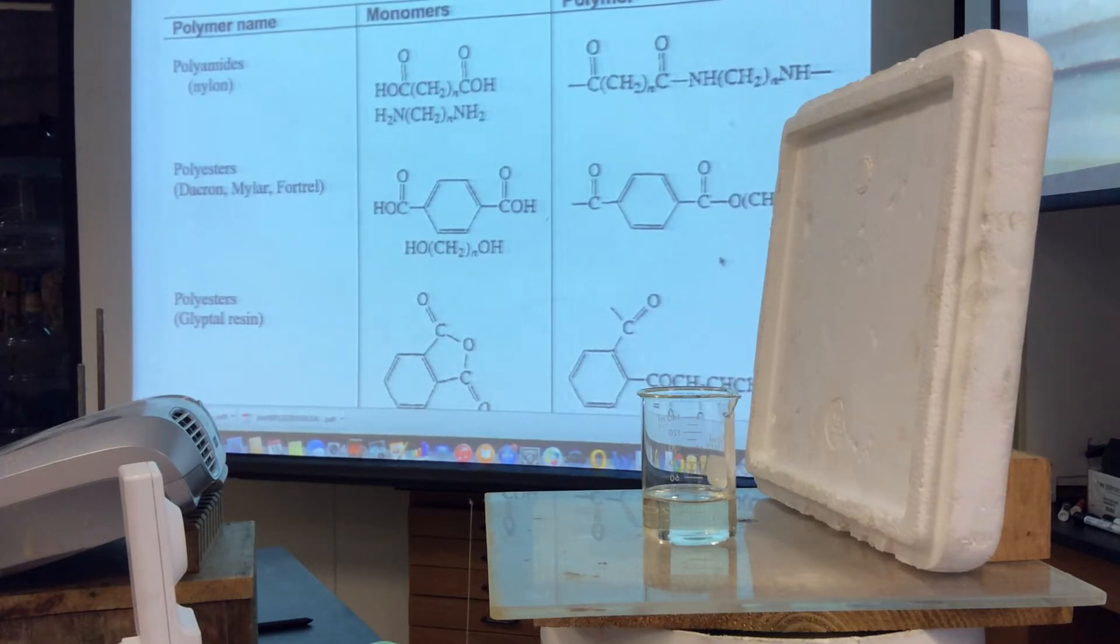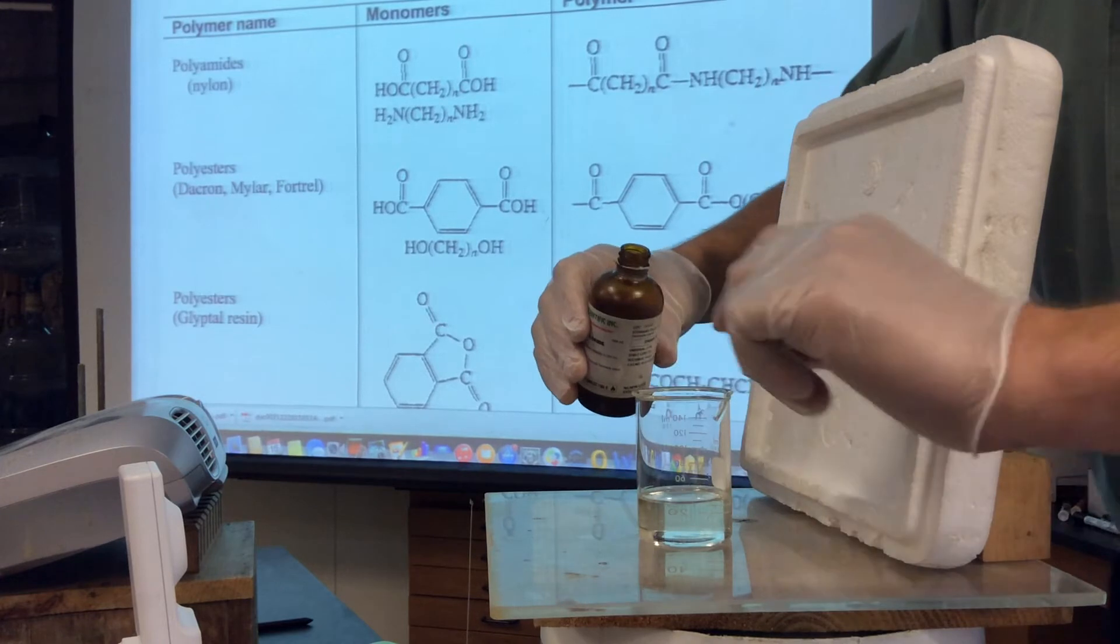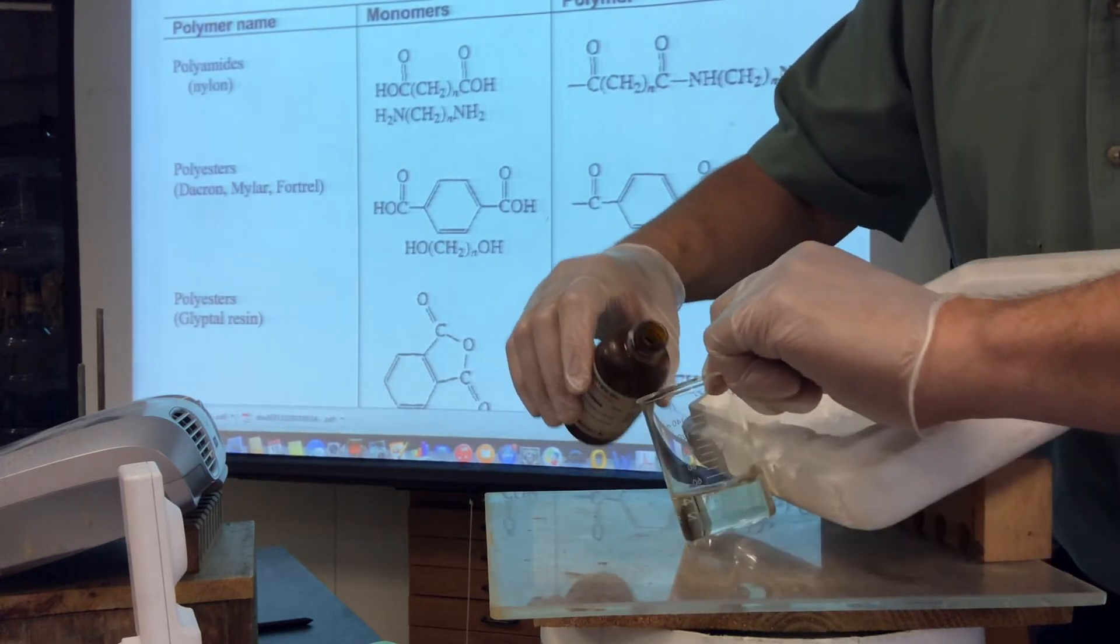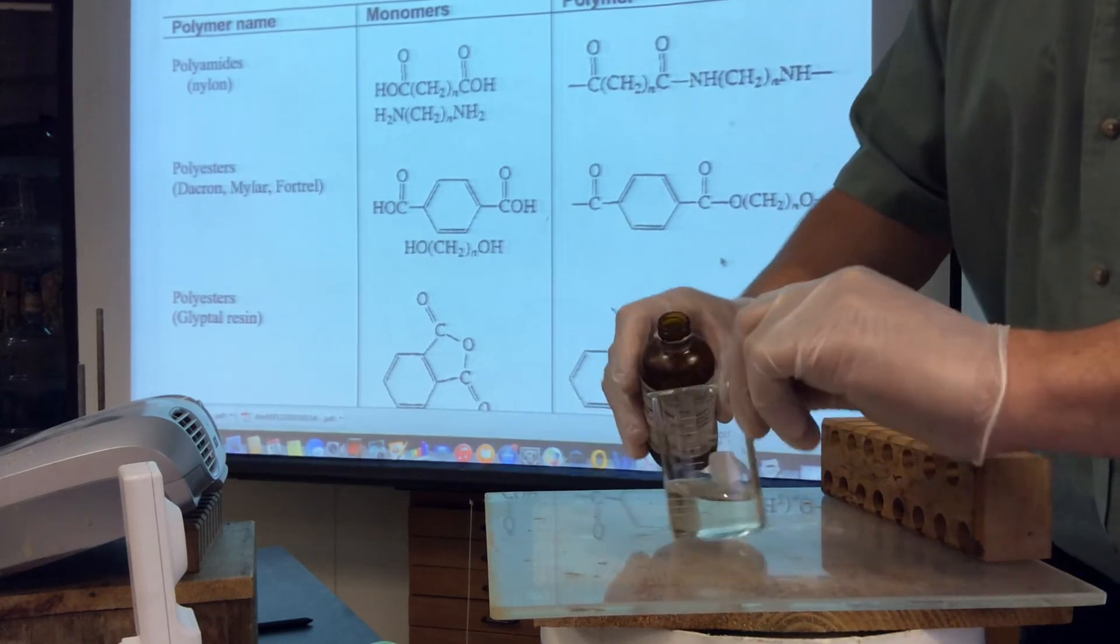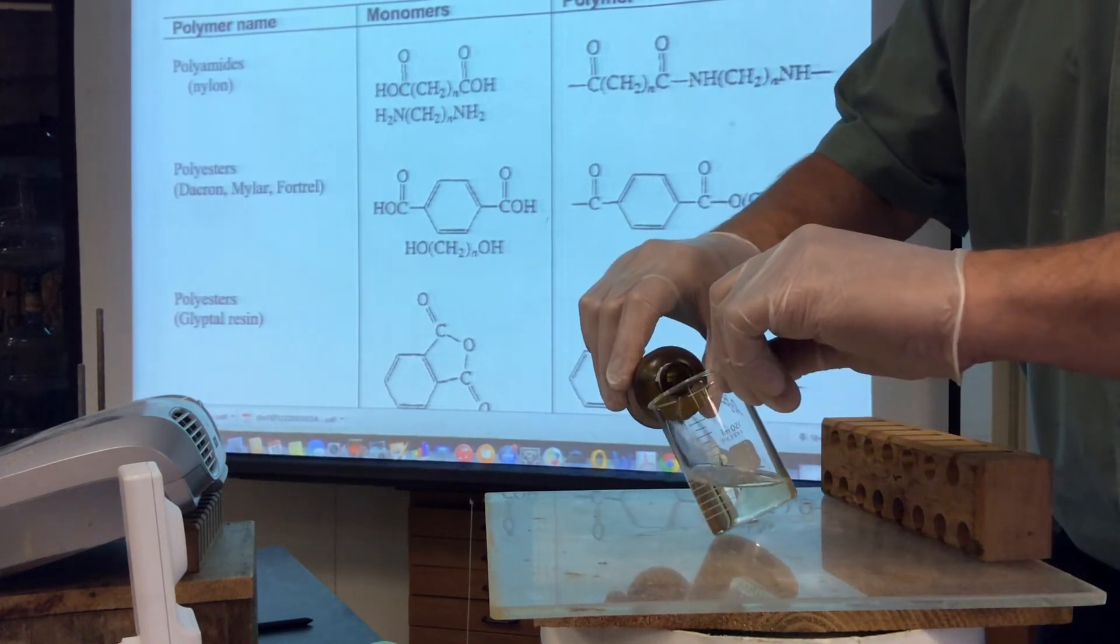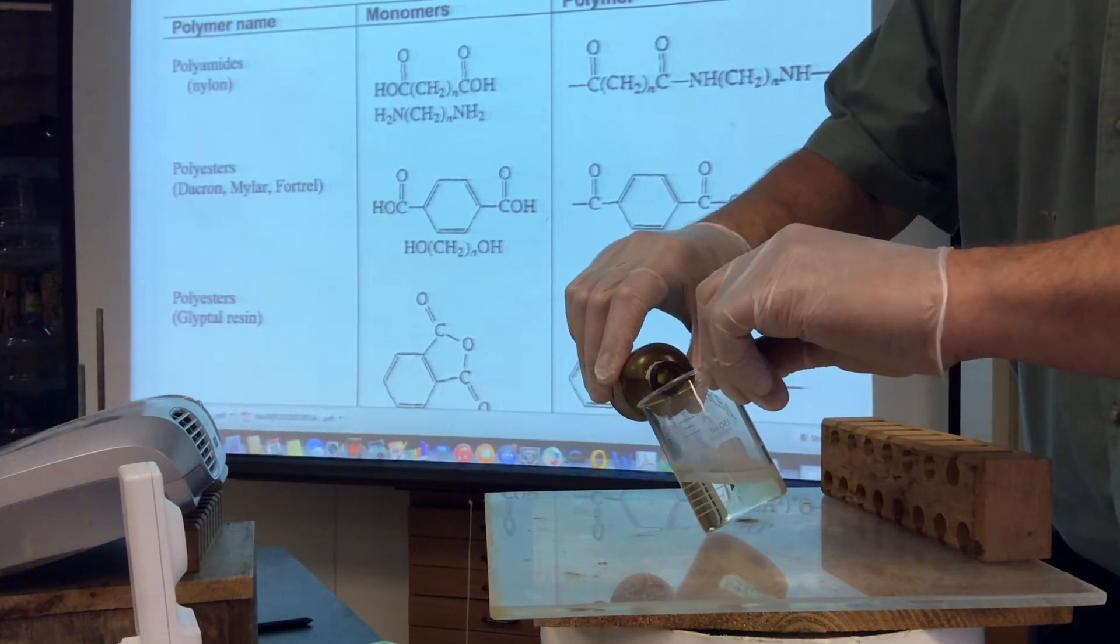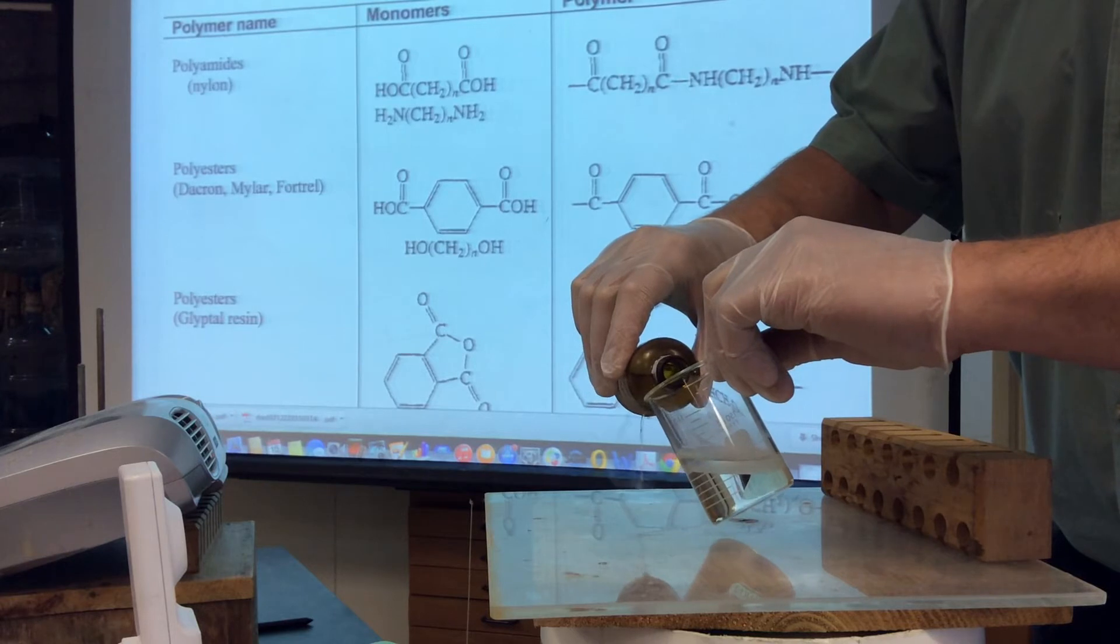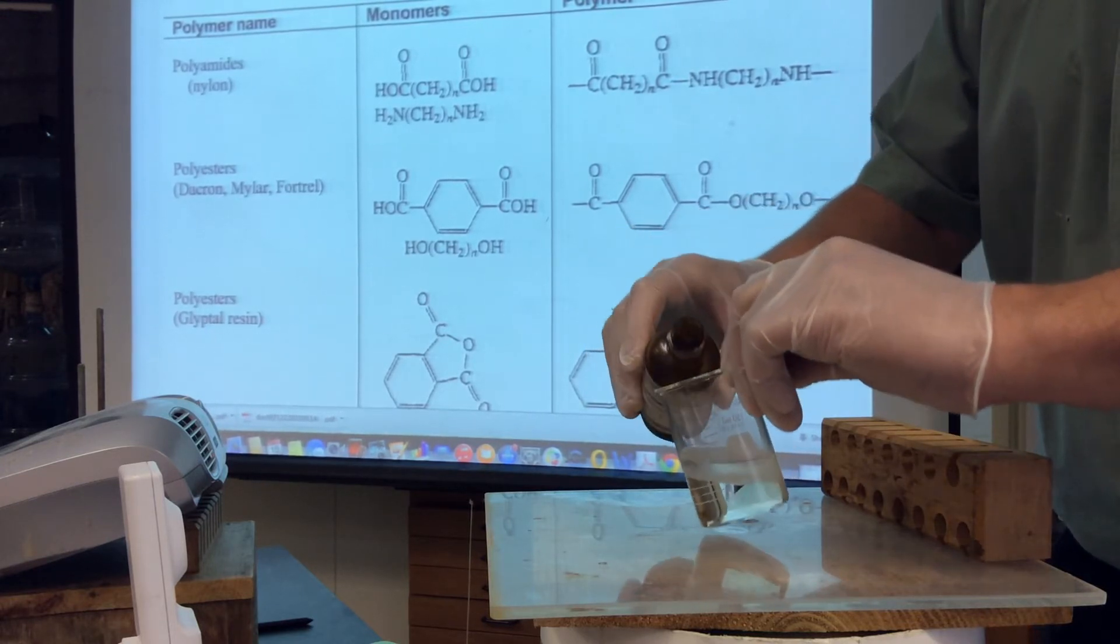So in this case, I'm going to try to open this bottle, which does not want to open. There we go. Alright, so I'm going to add this compound. I don't want them to interact, so I'm kind of pouring them on their side. Alright, I'm going to get rid of this.